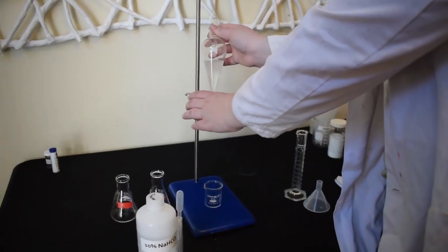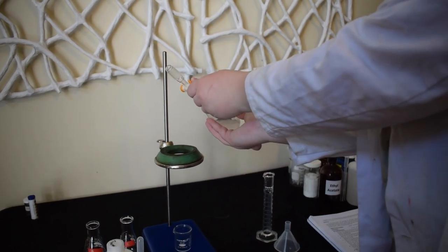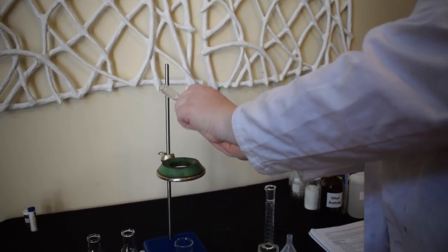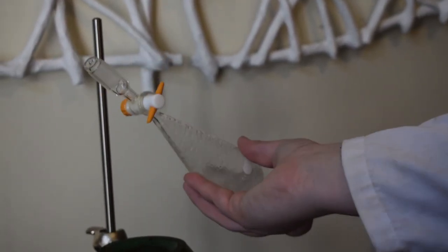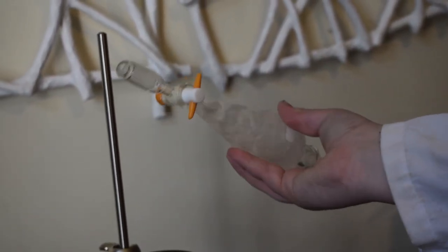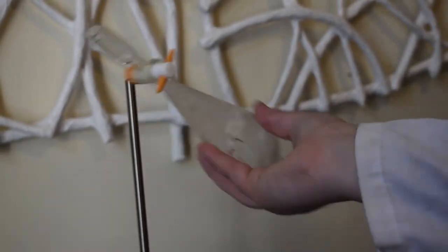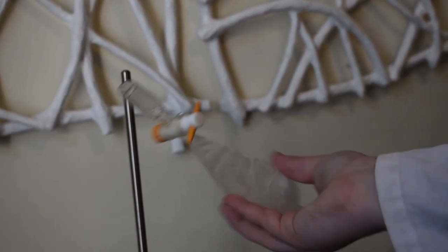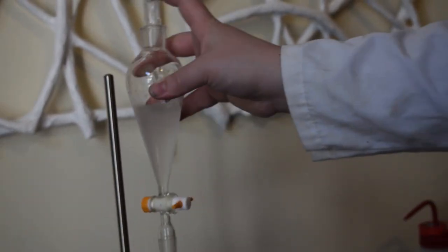Once it's added, we are going to cap the separatory funnel, hold our finger firmly on the stopper, and begin to slowly invert and vent. Each time you vent, there's a little pop, sort of like a soda can opening. You want to keep shaking and venting until there's no noise at all. Remember to close the stopcock after venting before you start shaking again.